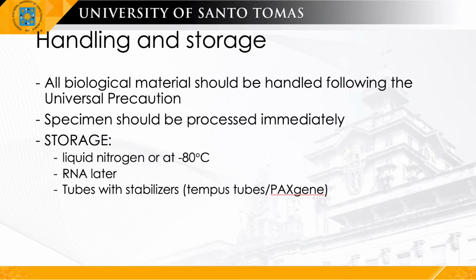Let's talk about handling and storage of RNA specimens. In most instances, the most critical part in RNA isolation is proper handling and storage of specimens. Once the sample is already degraded, there's no effective or optimized RNA isolation protocol that will be able to isolate high quality and quantity of RNA from these samples. So therefore, handling and storage play a very, very critical role. The following should be considered.